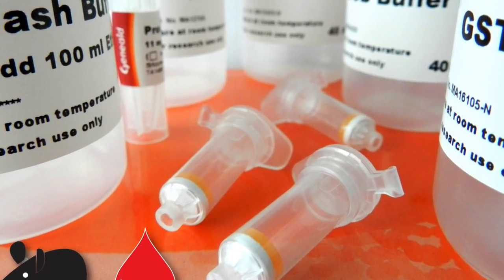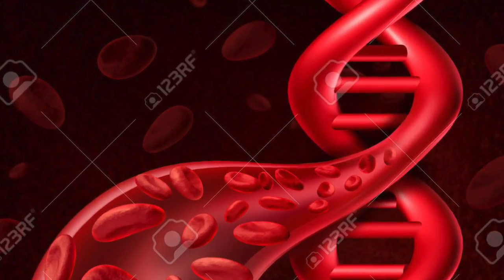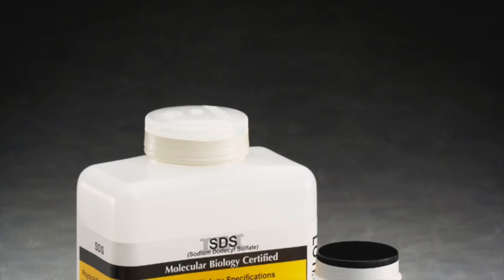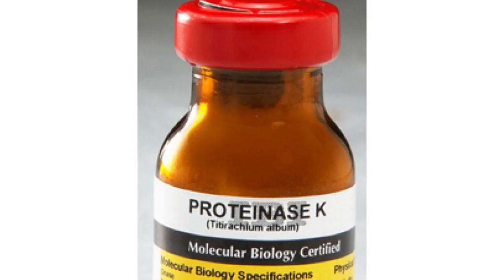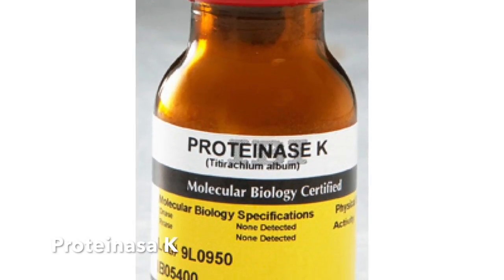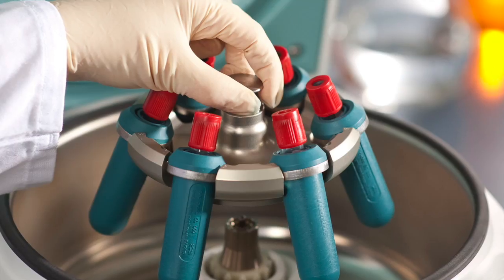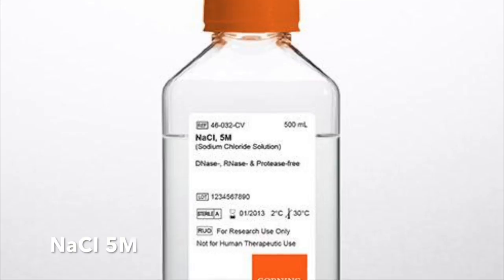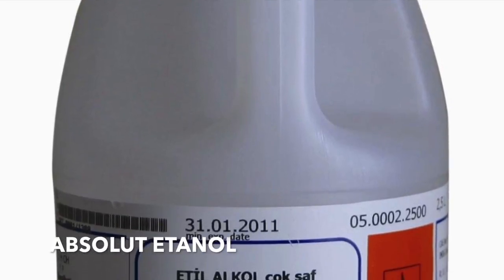The aim of this practice was to isolate DNA from human blood. To do this, the blood was washed with saline to remove the blood plasma, and then the cells were broken using a detergent to release their nuclei. Proteins were then removed from the cell membranes using an enzyme that degrades them. In order to make the proteins heavier and precipitate them by centrifugation, a salt was used. Finally, the DNA was precipitated by adding an alcohol.